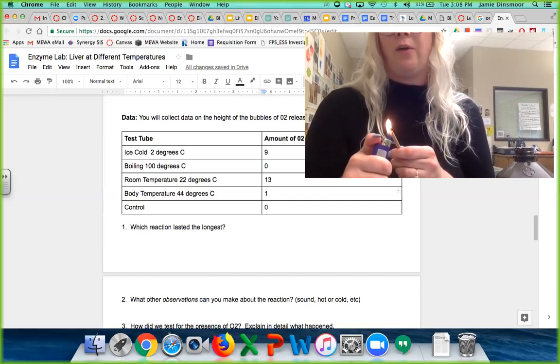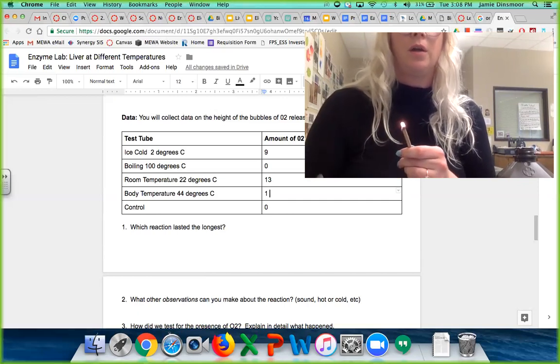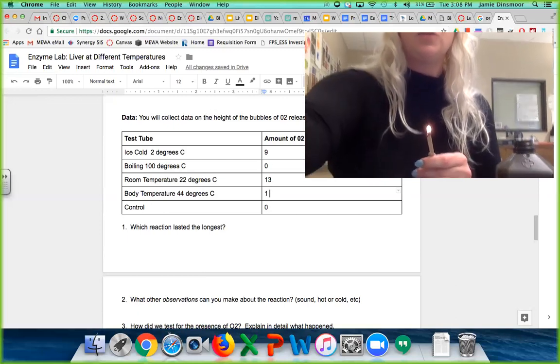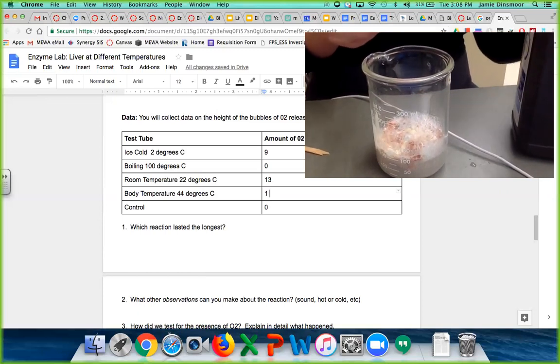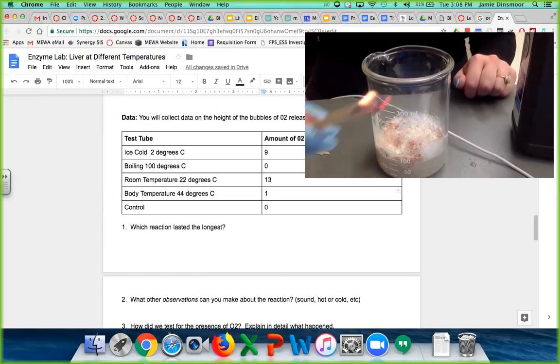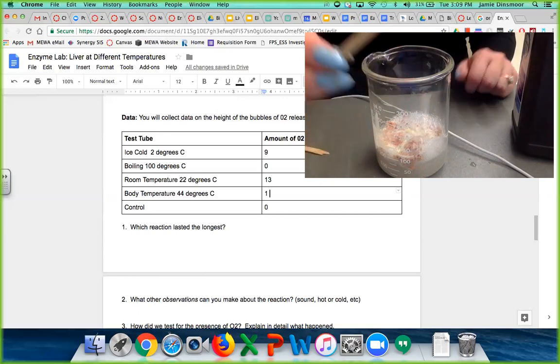Well, there's less in the bottle, yeah, but dark magic. Enzymes never get used up, right? They can keep getting reused. Okay, we've got our tiny little fire, which is now an ember. Uh-oh, it's coming back to life. There we go. Ember, smells nice in here.